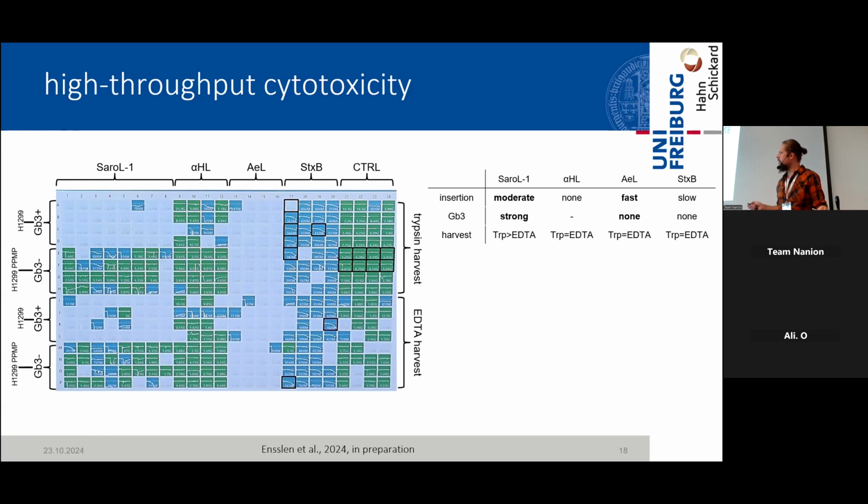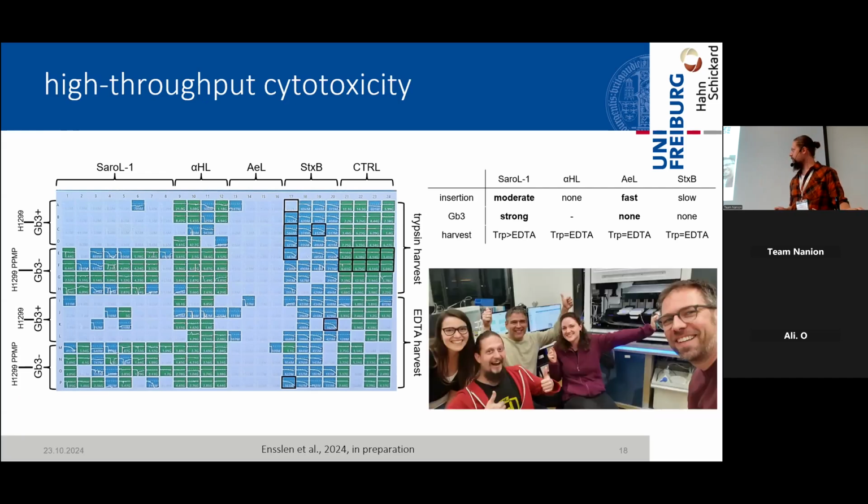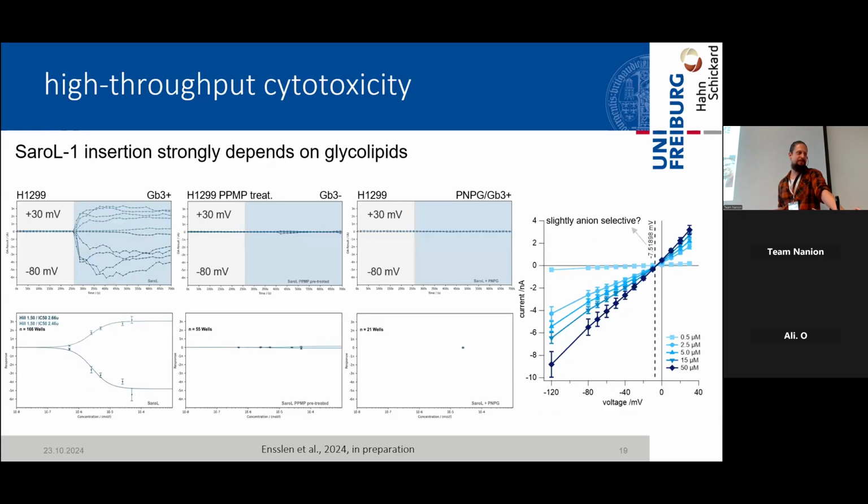You can see here, this is this blue color. So it happens, and if you look very closely, maybe not from outside, maybe the people online can watch that, also the resistance goes down over time, but with a very long time constant. And when we saw this, we were really very happy and said, okay, maybe we can quantify this result a little bit. And this is then what Tom helped us a lot with.